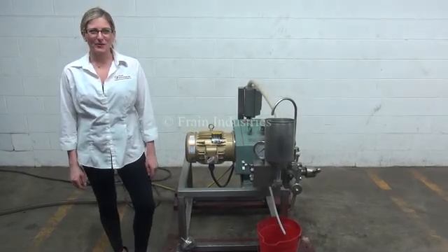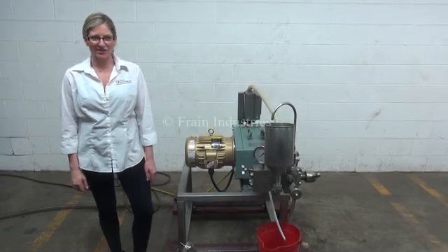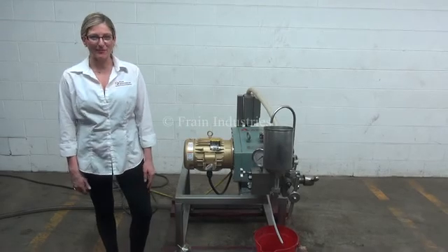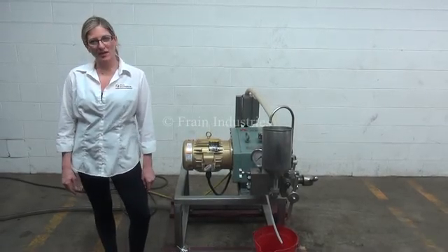Hi, I'm Katie with the Frame Group. Today we're cycling your APV Gallin two-stage homogenizer. We recommend you read the manual in its entirety before powering up the machine. The voltage is currently set to three-phase, 480 volts.